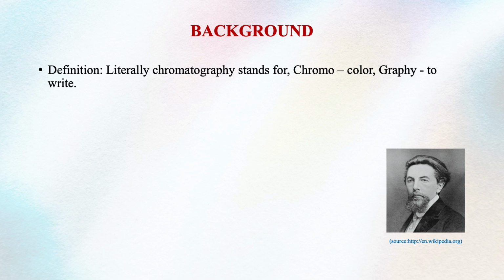Coming to the definition: if you look at the term chromatography, chromo stands for color and graphy stands for to write. That means the result we obtain at the end of the entire procedure of chromatography will be in a colored format. That's why this technique is named chromatography.